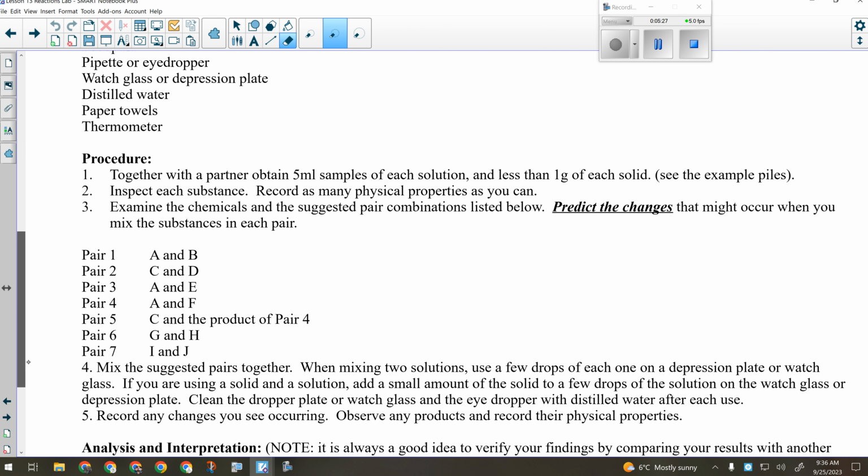We should be looking for changes to happen, and then obviously having a list of those would be a good thing to have maybe in the then part of the hypothesis, but obviously we're not there yet. So each time you mix together these different reactants, you should probably get different signs of a chemical change. Like those signs might respond to the thing you put together. Hint, hint.